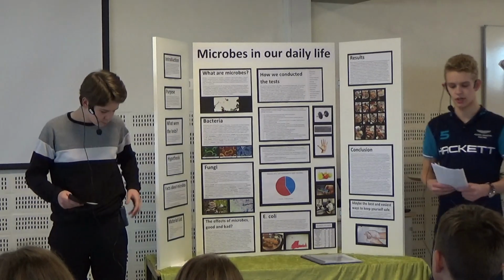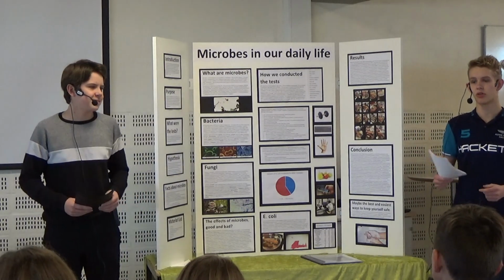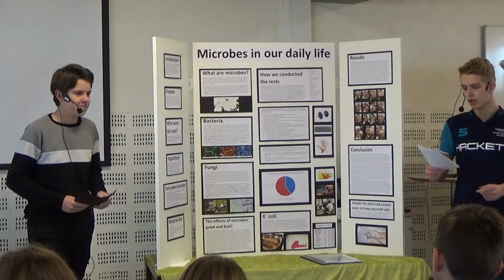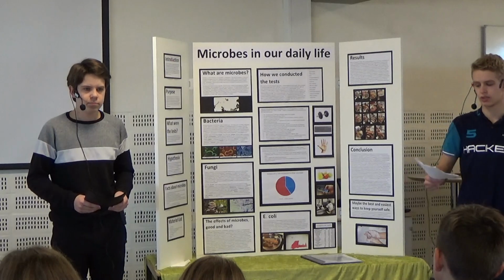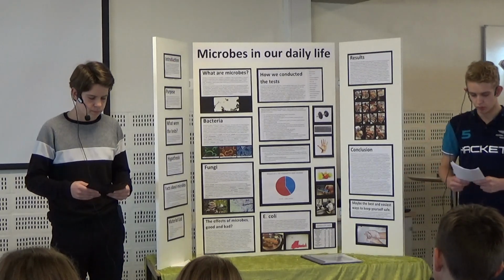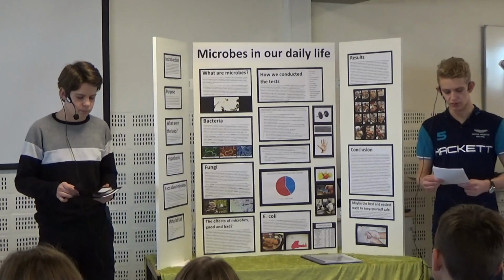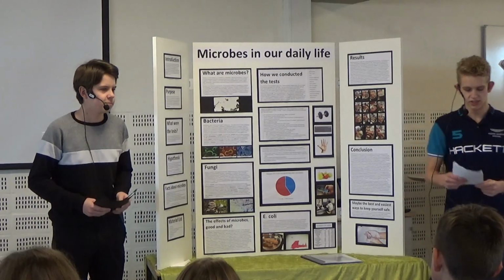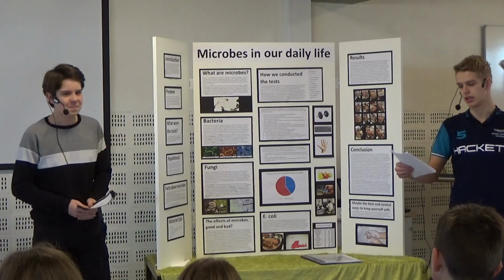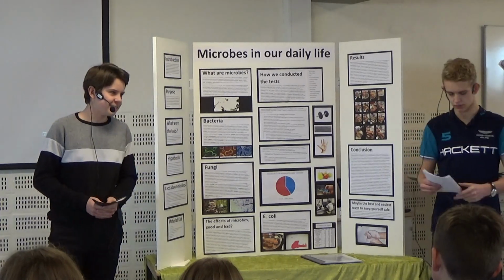So why did we choose this topic? We chose this topic because we thought doing microbiology would be fun, and we wanted to know more about why people get sick and what microbes we're dealing with every day. We wanted to test different places in our environment to test if there are any harmful microbes there. So to test this, we had to grow and identify the bacteria and fungi.